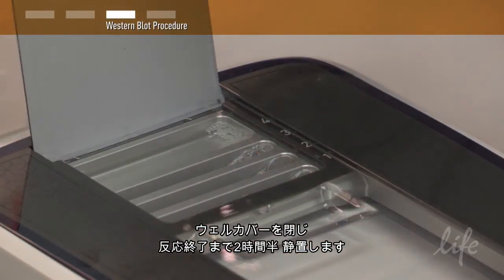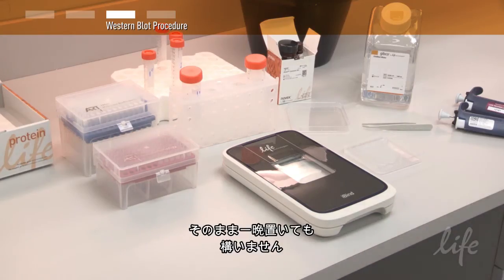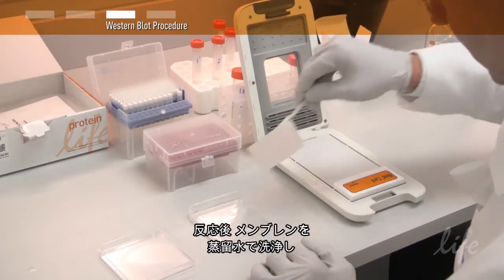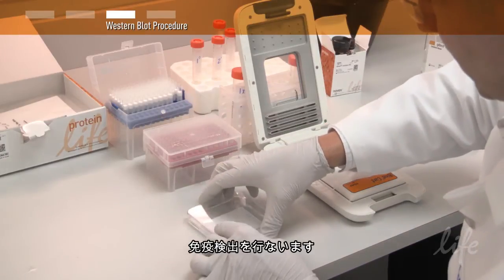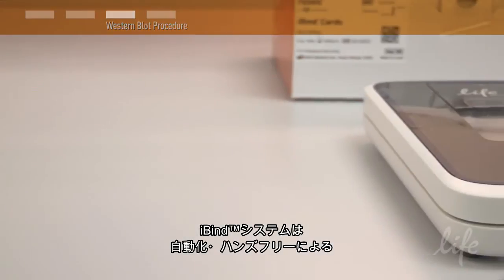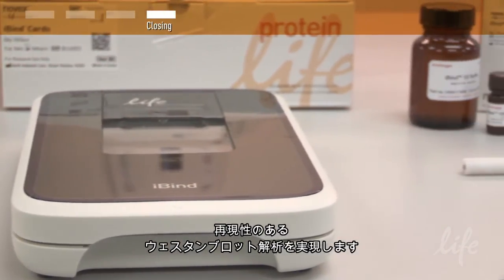Then close the well lid of the iBind device and incubate for at least two and a half hours. You can even leave it overnight. After incubation, rinse the membrane in water, discard the used iBind card, and proceed to your immunodetection protocol. For a hands-free, walk-away, and reproducible Western blot, try the iBind Western system.